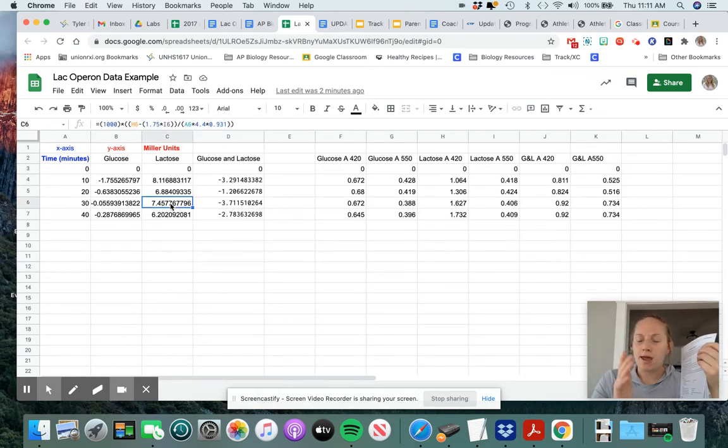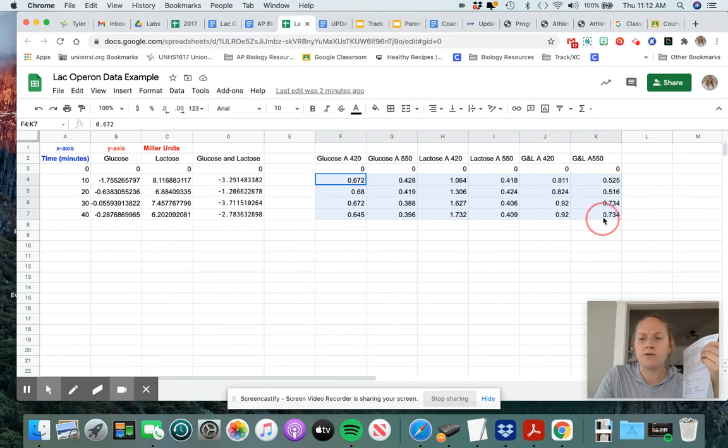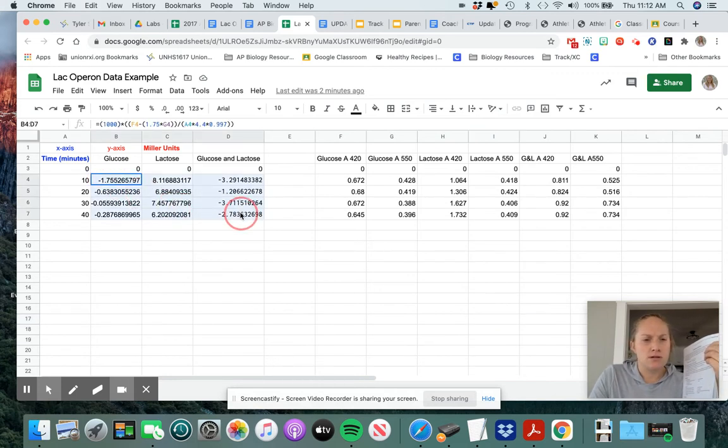To recap, you need to change out these numbers here to fit your own numbers. Double check to make sure they are correct. Double check with your group to make sure you have all set that up correct, because you should all be the same. Then you come over here and you need to change only your A600 values, which is just this very last number right here.